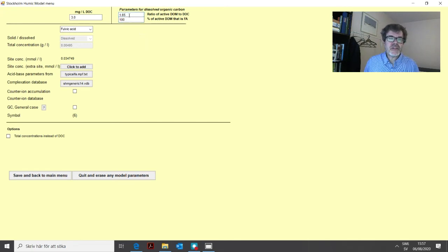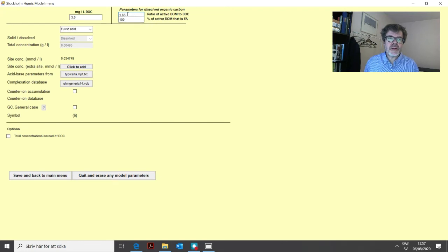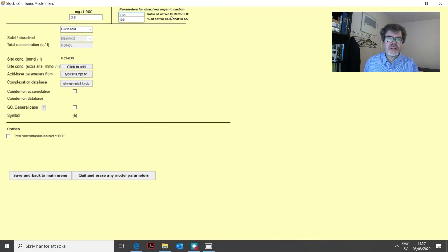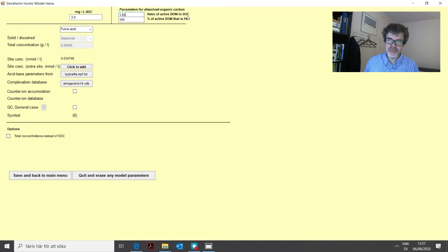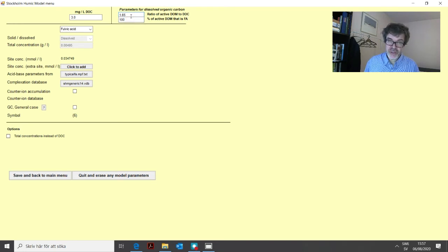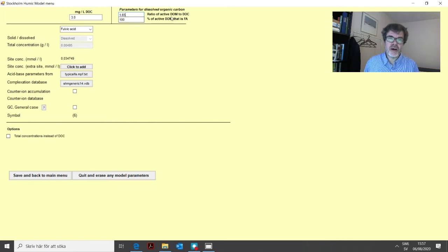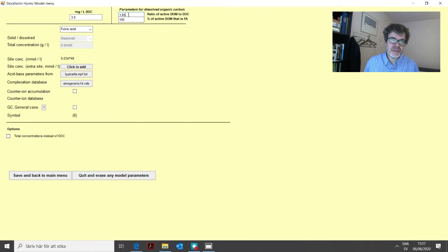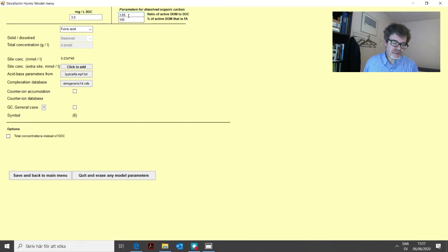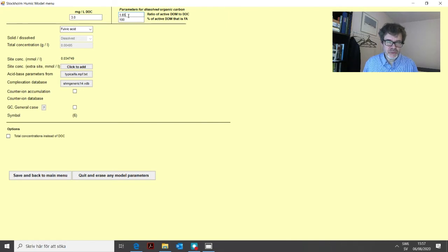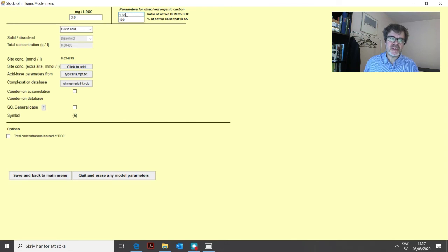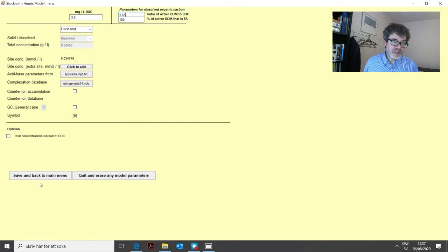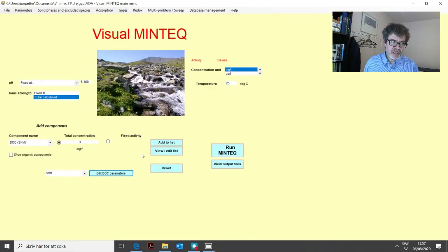We can also change this ratio up here. This actually means that 82.5% of the dissolved organic matter is active with respect to proton and metal binding. This figure has been, well there are different estimates for this by different authors. If you would like to change this you can do that here and save it also as the default value. But now we are happy with this. We escape from this menu.